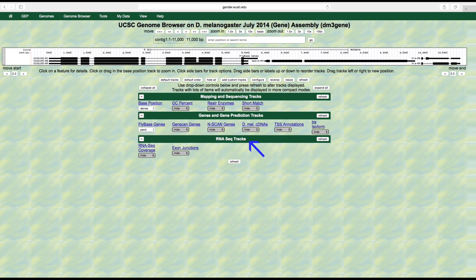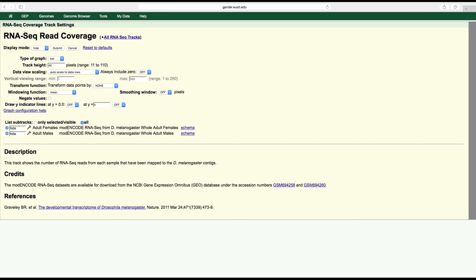To visualize the RNA-seq read coverage data, click on the RNA-seq coverage link under the RNA-seq track section to open another window in order to specify the settings for this track.